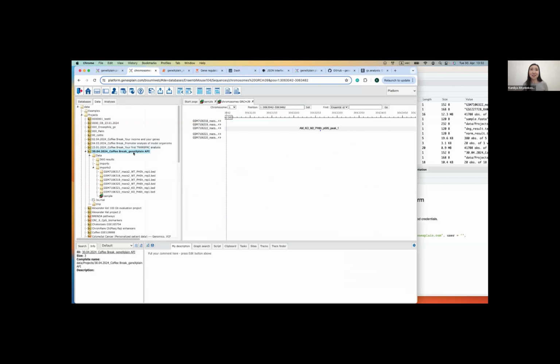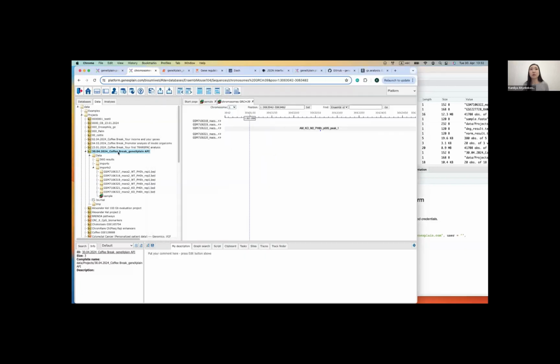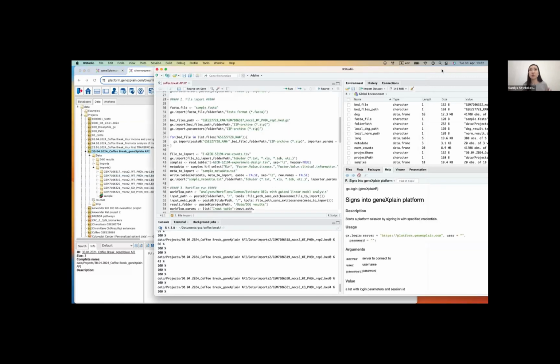So you might want to contact your manager from our team to see what space is available for you in the platform for your account. So this is the limitation, your project size. And if you are uploading data which is still inside the limits of your project space, you are free to upload whatever sizes fit.